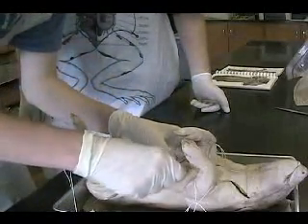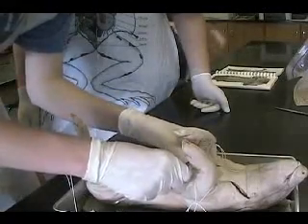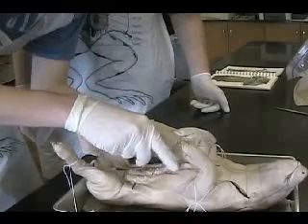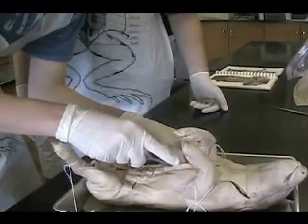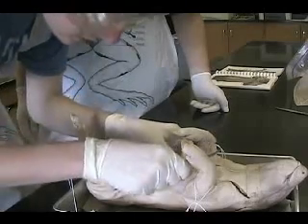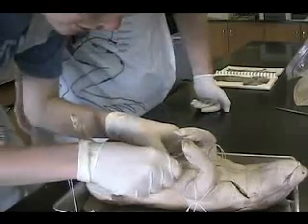Are we supposed to be cutting through the skin or what? I'll just cut through the second one. Actually, I think this is the skin. This is wrong right here. See, we shouldn't have got a deformed one.